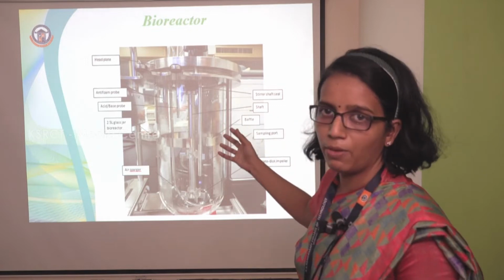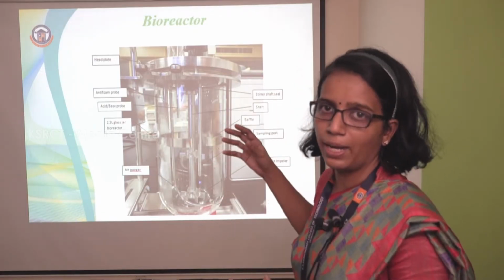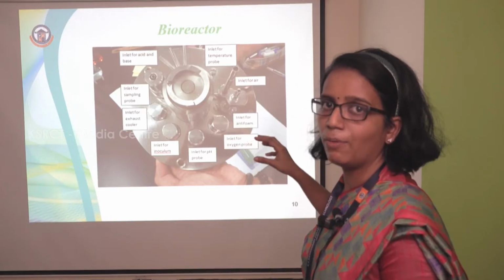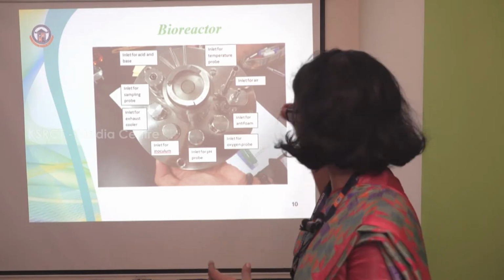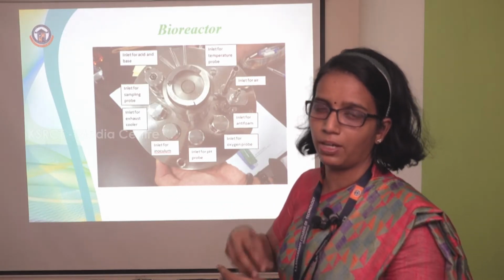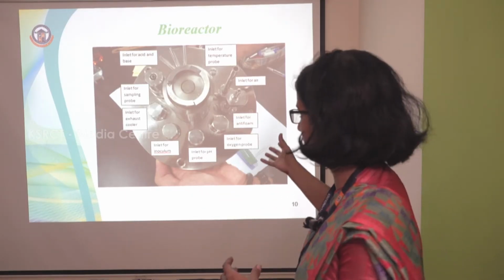This is the baby fermenter, which has the capacity to ferment a liquid of about 2.5 liters. It is normally made of glass, and it has a specific lid made of stainless steel. This lid will have provisions to add all your nutrients as well as have your sensors inserted, and our aeration provider will be there. If we need to sample something from the fermenting liquid, we can also access it through these ports available in the lid of the fermenter.